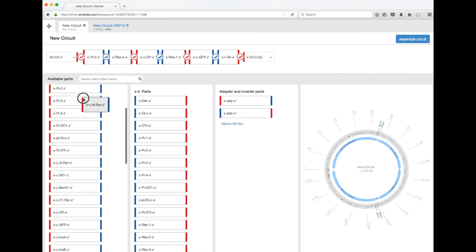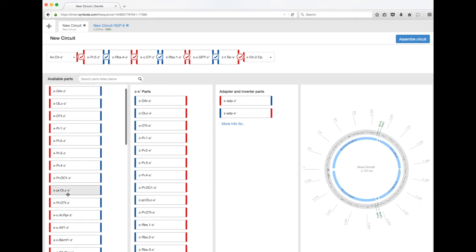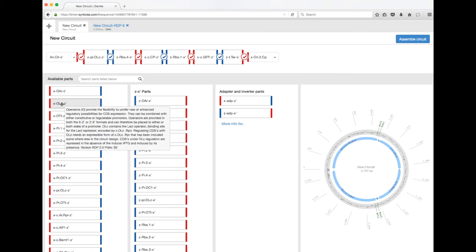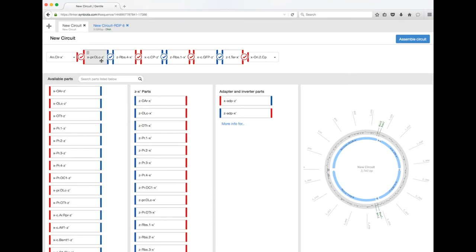For an even more complex circuit, you can use an operator. We're going to find the promoter under the control of LacI — we'll put this promoter in and get rid of the previous one. This promoter has the operator site for LacI in it. In the absence of IPTG, the LacI repressor will bind to this operator and prevent the promoter from working. When you add IPTG, it causes the LacI repressor to fall off and therefore the promoter can work.